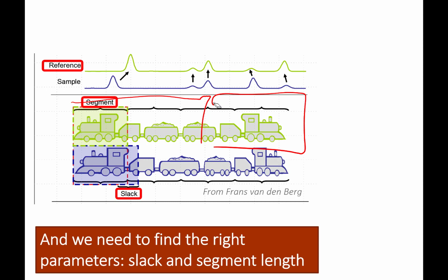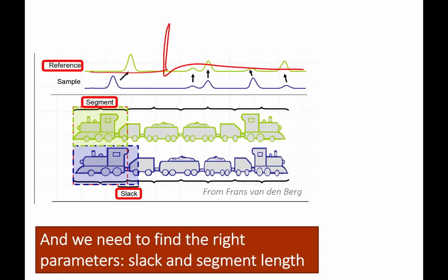So you can only handle very minor shifts. If on the other hand I make the segments extremely narrow, then I can basically align to almost everything, and I may even end up with my data just in one line, so to speak, which is perfectly aligned but not very meaningful. So we have to find a compromise.